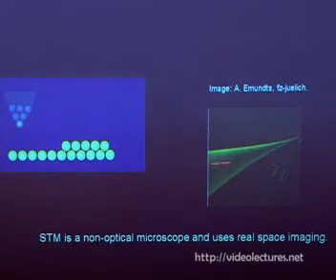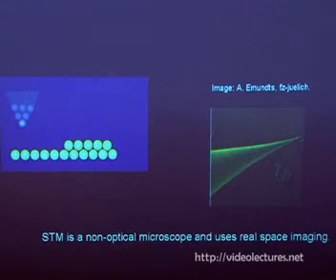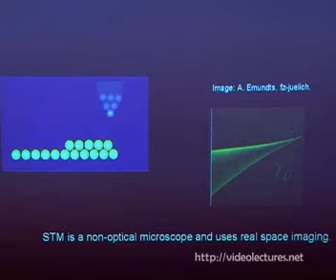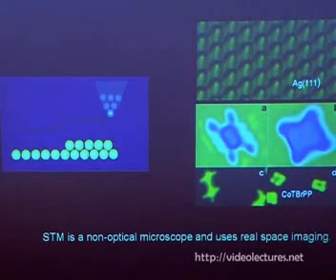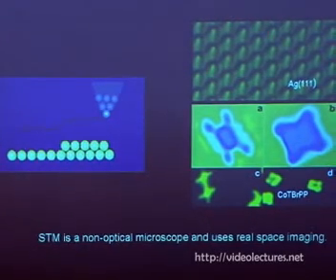And this shows how the STM positions the tip and the surface. And then what we do is that we apply the voltage between this sharp metallic tip and the surface. The distance between them is less than 1 nanometer. Actually, it's about 5 angstrom. If you apply the voltage, then we scan the tip across the sample surface, and we get this kind of profile of the surface. Because STM has an atomically sharp tip, we can get the images of individual atoms, also the molecules.